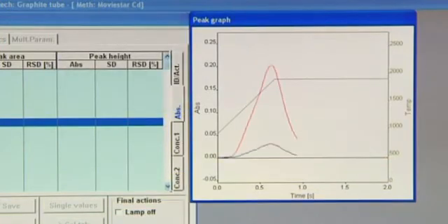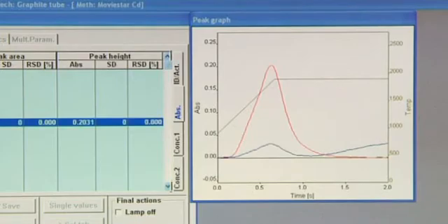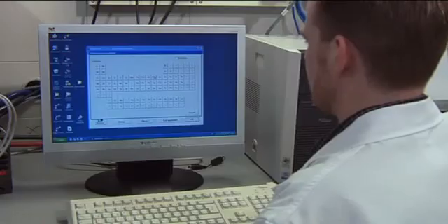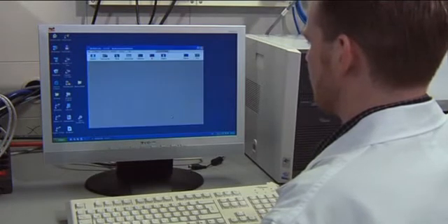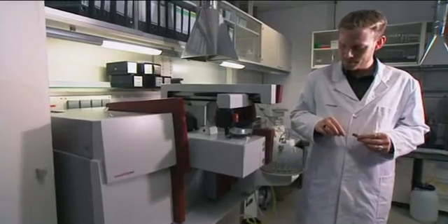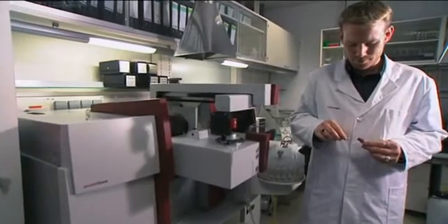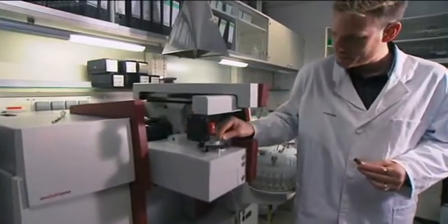Equipped with an automatic solid sampler, Zenit opens up new ways of analyzing solid samples. With the solid sampling technique, the time-consuming sample preparation can be reduced to comminuting and optionally homogenizing the sample. This minimizes the danger of contamination and loss of material being analyzed.